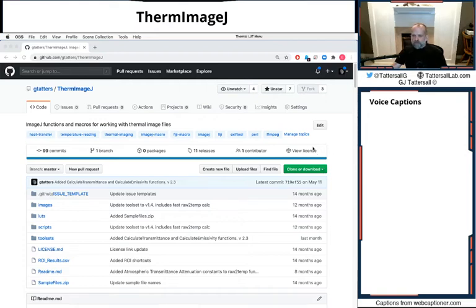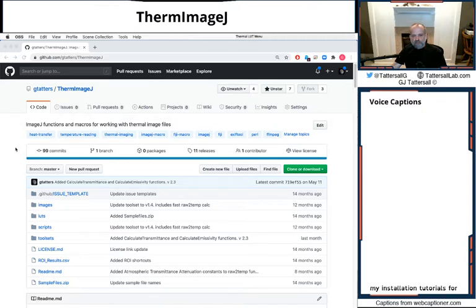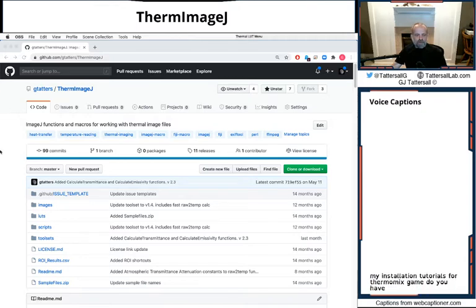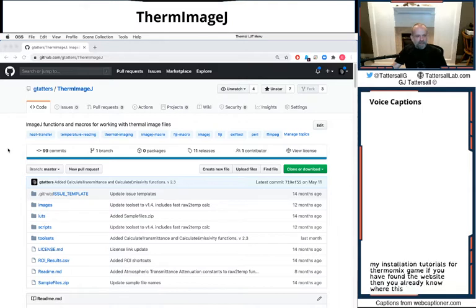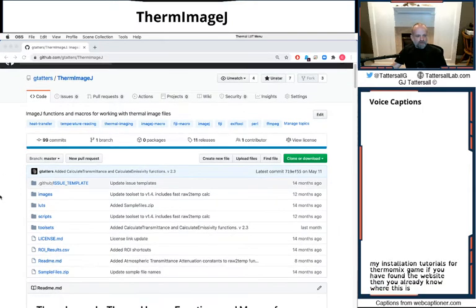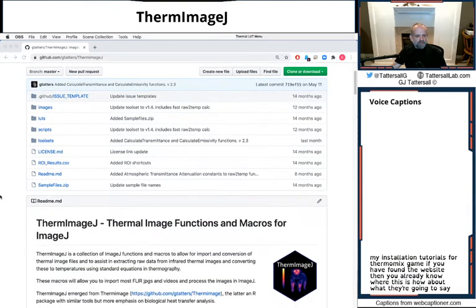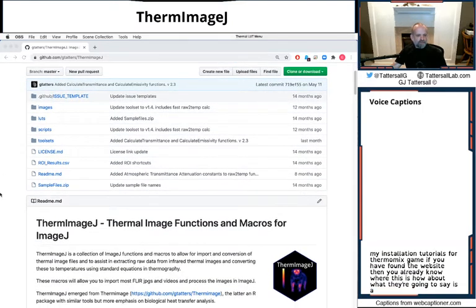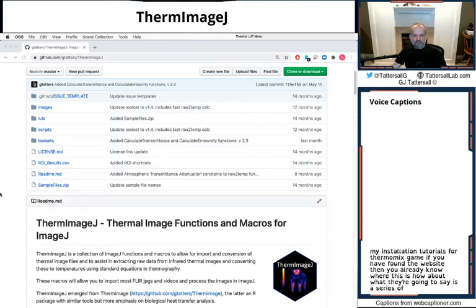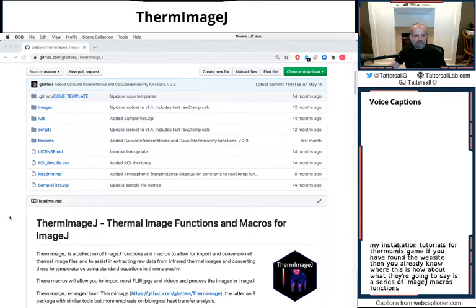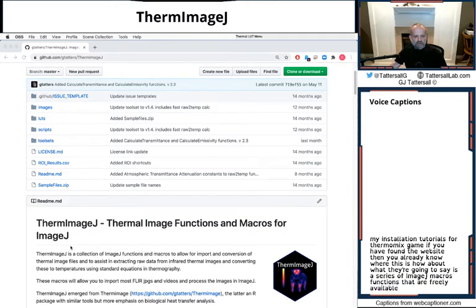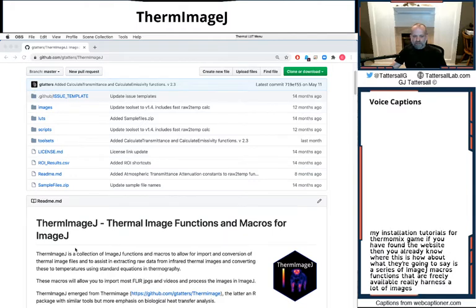Welcome to my installation tutorial for ThermImageJ. If you've found the GitHub website, then you already know where this is. But what ThermImageJ is, is a series of ImageJ macro functions that are freely available that really harness a lot of ImageJ's powers and analytical powers.